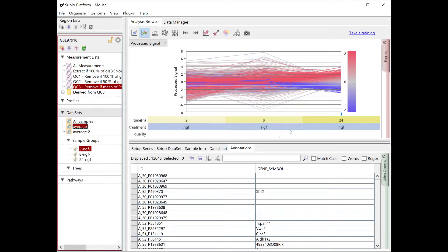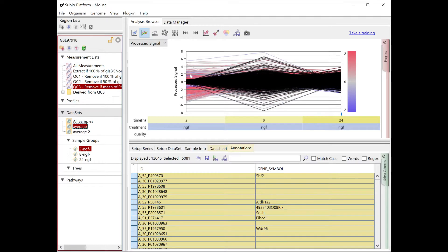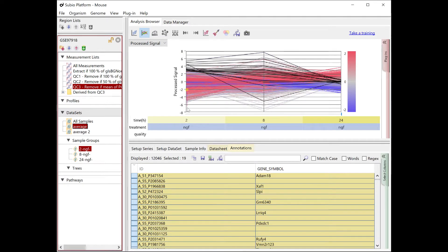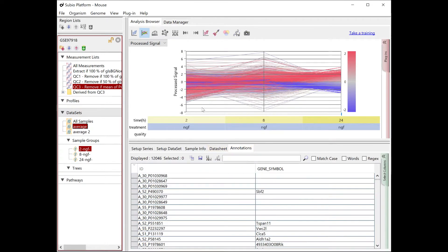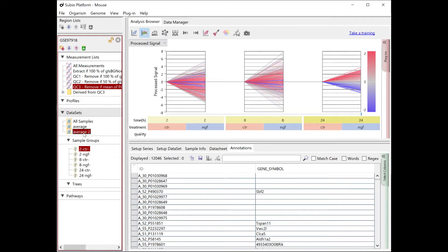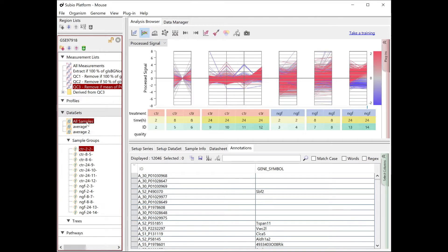Three sample groups represent two, eight, and twenty-four hours after NGF treatment against the control at each time point. Processed signal near zero indicates not changing from the control. Positive values indicate upregulated and negative values indicate downregulated.